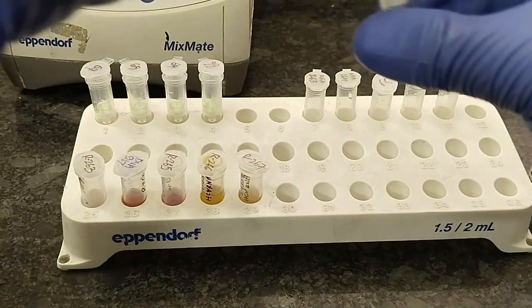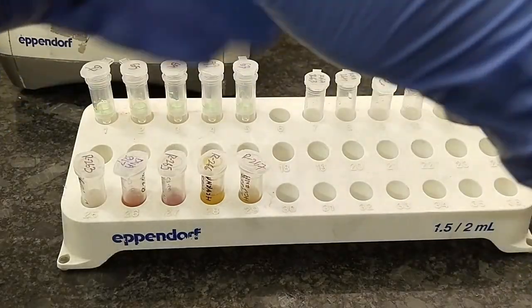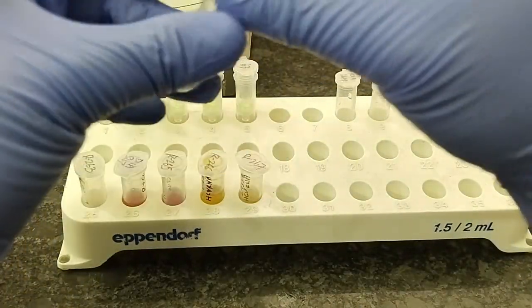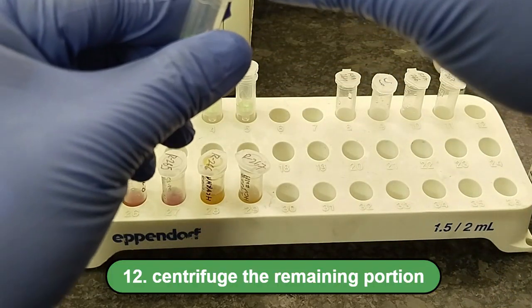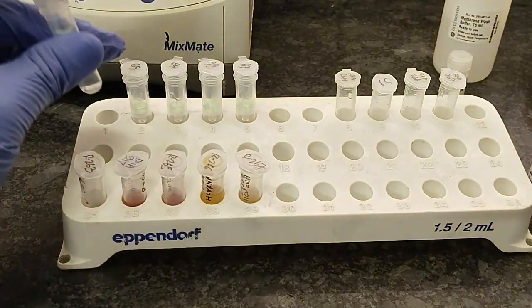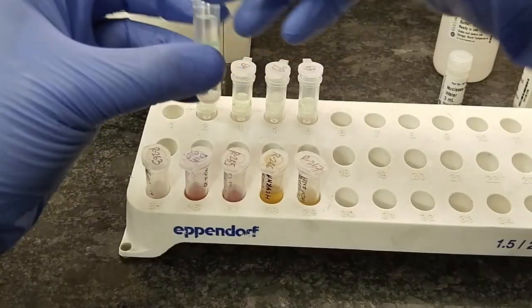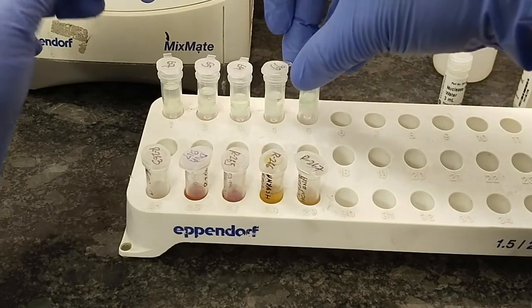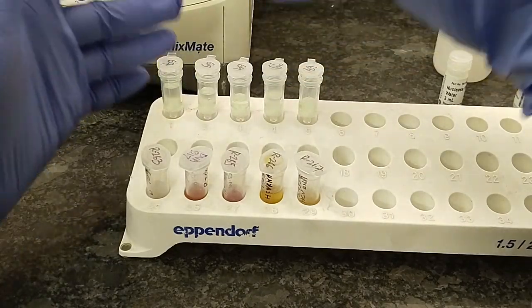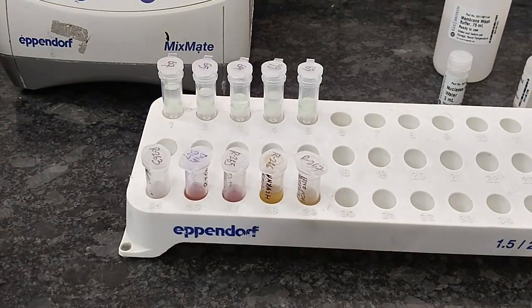Now we have to add the leftover solution to the binding column. Just put it in the column. You can see that the leftover portion is transferred, and now the column is centrifuged for the second time at 12,000 rpm for 30 seconds at room temperature.